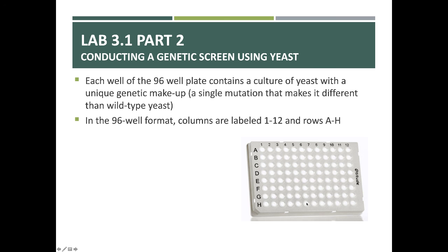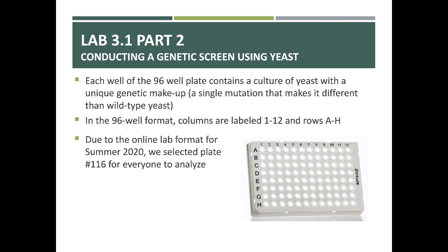It's a very powerful but rather simple way to categorize the mutants. Now, since the lab is online for this summer, everyone's going to work with plate 116, so we can show you the data from this one set of experiments.